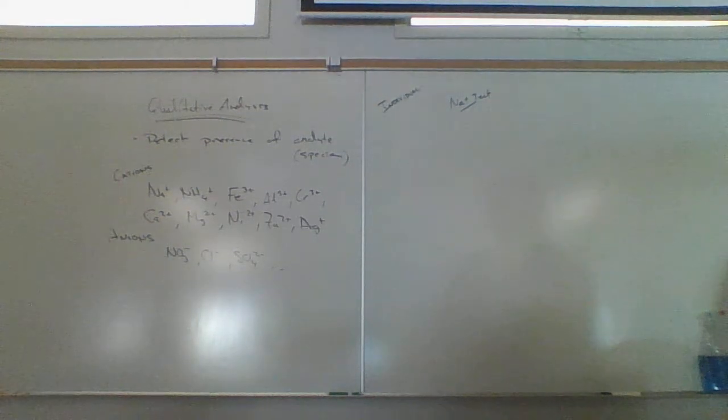So what we do is keep trying to clean this. There's some certain tricks you can use. They're in the book's procedure. But eventually it's going to come out clean. And then we'll test our sample by just getting a drop or two of liquid on the surface of the wire and then seeing, does it give a bright yellow flame? And this one might be difficult to interpret because is that due to improper cleaning, or is that due to a positive test for sodium in DI water? There shouldn't be any sodium in DI water. All right, so that's the sodium test.